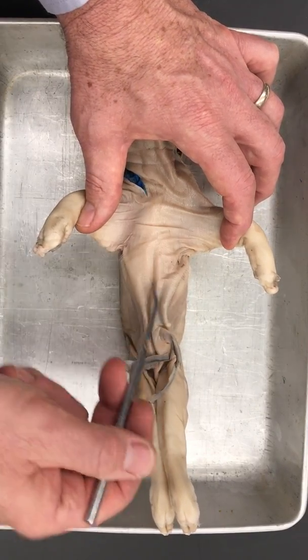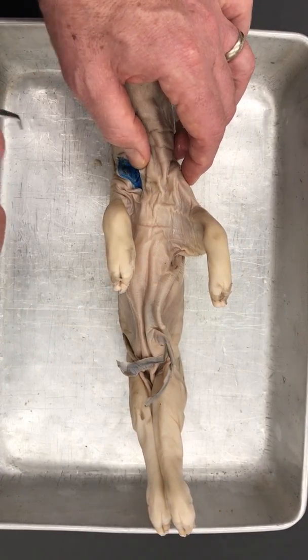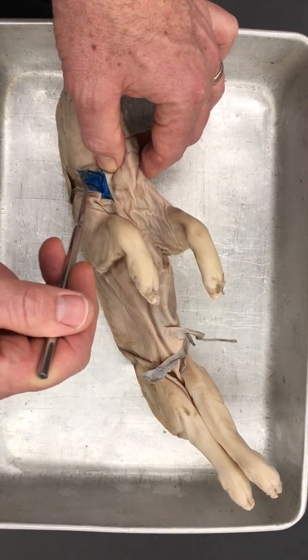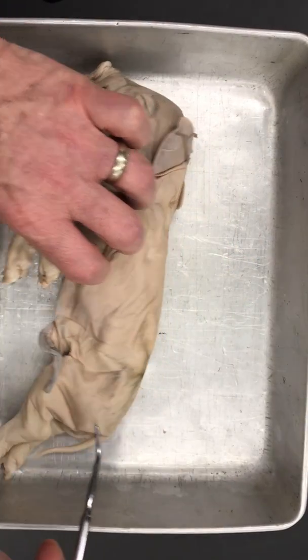Superficial means on the surface. Deep, so if we get deeper in there, like it's going to be deeper in there. This happens to be an incision where they embalmed the pig. Now it's blue. It's blue because they inserted latex rubber in there. Okay, so let's continue on quickly here with the tour.